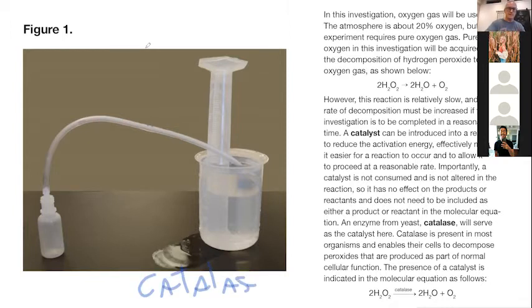What it does is it takes 2 hydrogen peroxides and reacts them together to release 2 moles of water and a mole of oxygen gas, which is much better than having peroxide around, because peroxide, as I mentioned, forms these radicals and basically just destroys everything in sight. And so if you don't have one of these around, you get wiped out. Basically, it just takes all your electrons away and wipes you out.